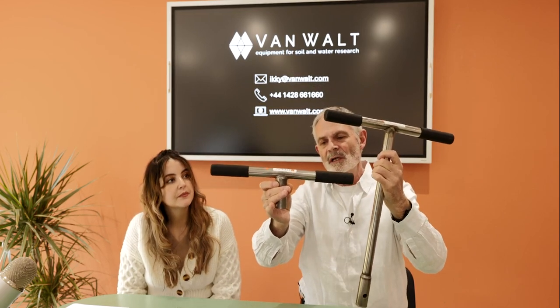They come in different lengths because it's always important to make sure that when you're sampling, you use your devices from a correct height so that your body posture remains straight. You don't have to work above your height, and you don't have to bend over too much. So using the correct handle is important.